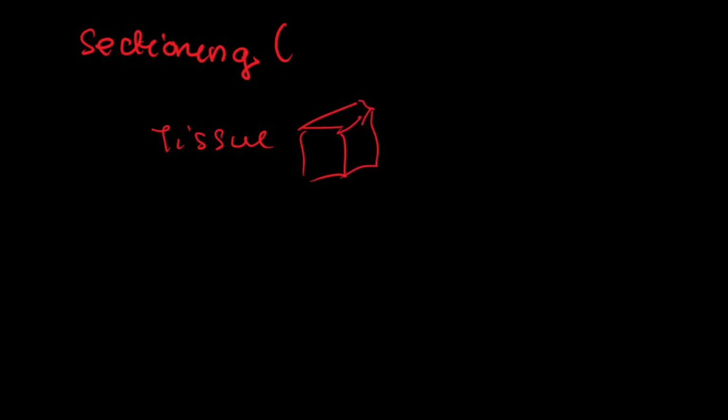So what happens in the microsecting or the sectioning is that we now first of all scrape off or trim away the surplus wax. Okay, paraffin is wax as it is, and in sectioning, first of all, the excess wax on the surface of our tissue block is trimmed away. Then we use a special device called a microtome.